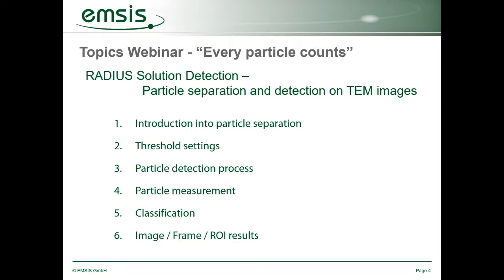It starts with threshold setting, a very decisive process, continued by the particle detection process itself, followed by obtaining the results by means of particle measurements. And if you like to, you can do a further classification of the results and even compare these results later on between different areas on your image, the so-called regions of interest or ROIs.